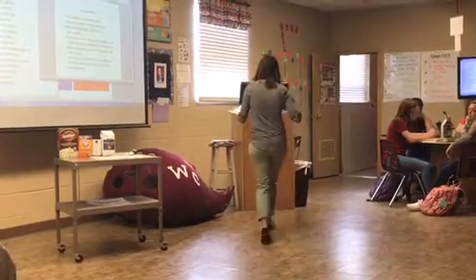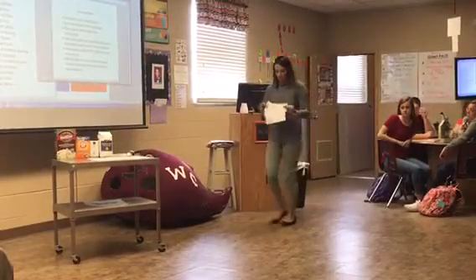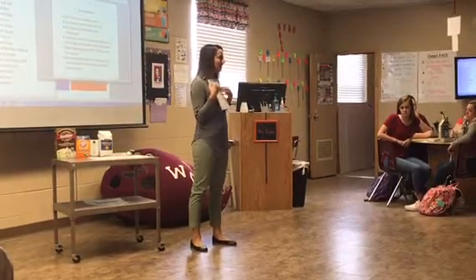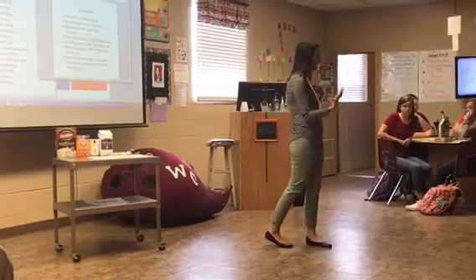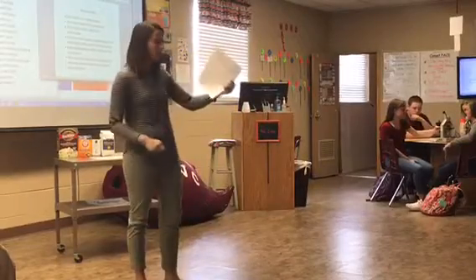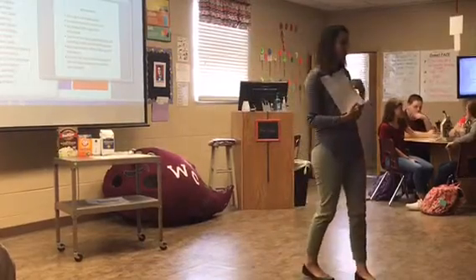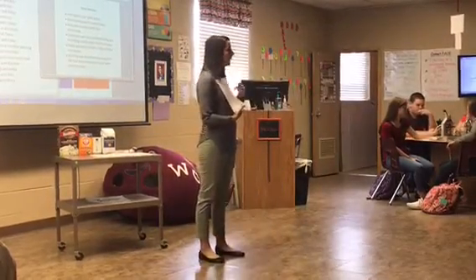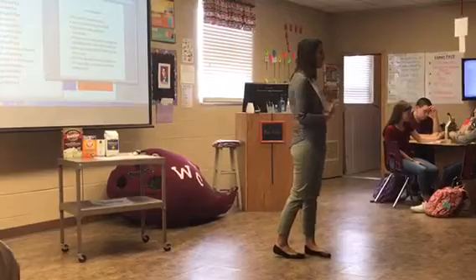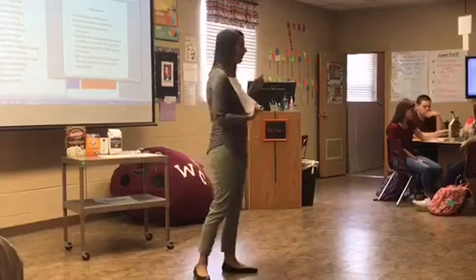Alright, so now, if you look at your lab sheet, you'll notice the first thing you need to do before you even put it under the microscope is to write down physical evidence just by looking at it with your naked eye. So what is the color, what does it look like, how many particles are there, that kind of thing. Then, you're going to put it on the slide. Guys, go ahead and power them on. Turn the lights on so that we know they're working. Alright, you're going to place it on the stage, secure the stage clips, okay, hold it in place so it's not moving around. You're going to focus it first on the low objective and then move to medium once you get it focused, okay?